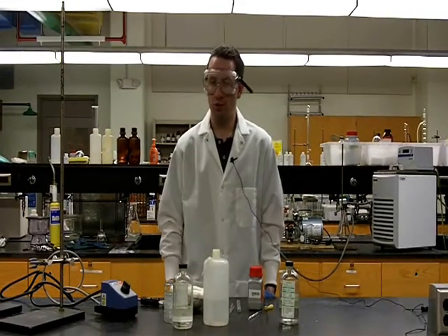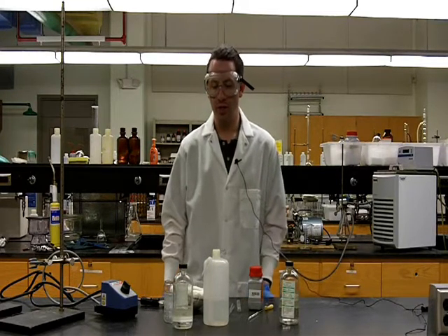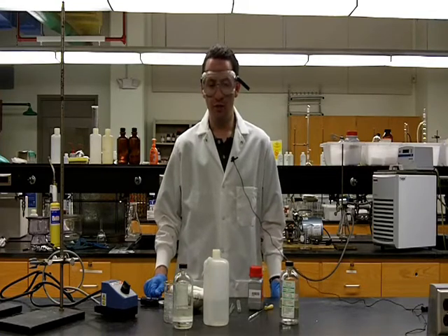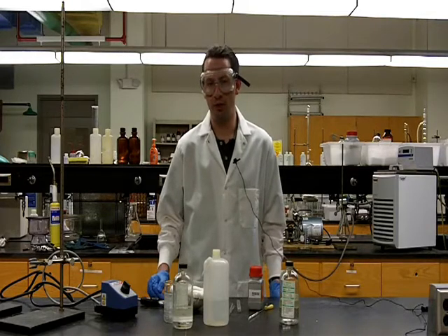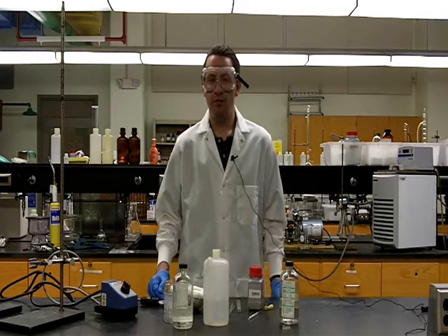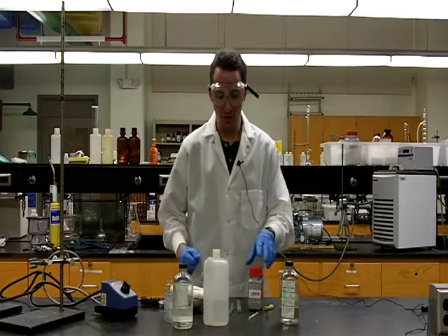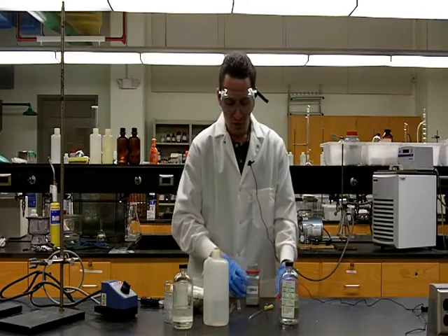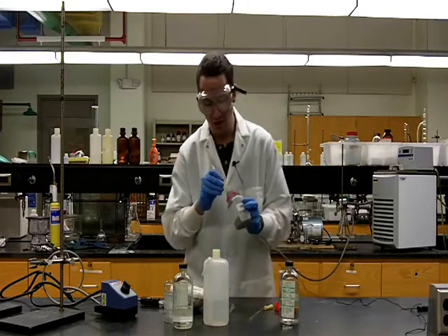Secondly, any impurities should be either completely soluble in the solvent at any temperature or completely insoluble at any temperature. Third, the solvent being used should not react in any way with the compound being recrystallized. And finally, the boiling point of the solvent should be below the melting point of the solid.